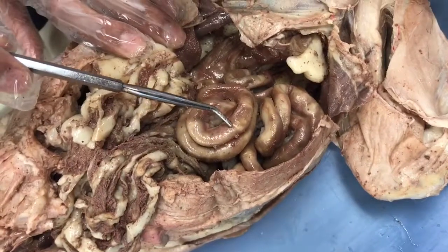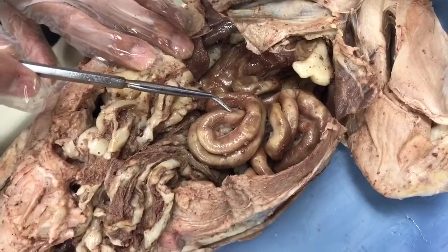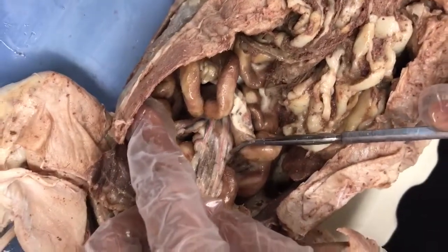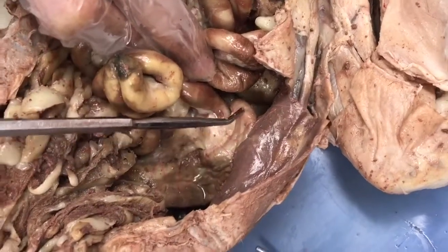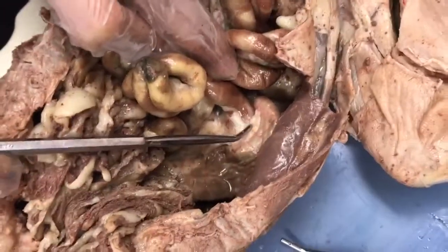Okay, these are the small intestines. They're posterior to the omentum, and they absorb nutrients from food. Deep to the small intestines is the mesentery, and its function is to attach the small intestines to the abdominal wall. Okay, this is the ileocecal valve. It's lateral to the cecum, and its function is to connect the small intestines to the large intestines.